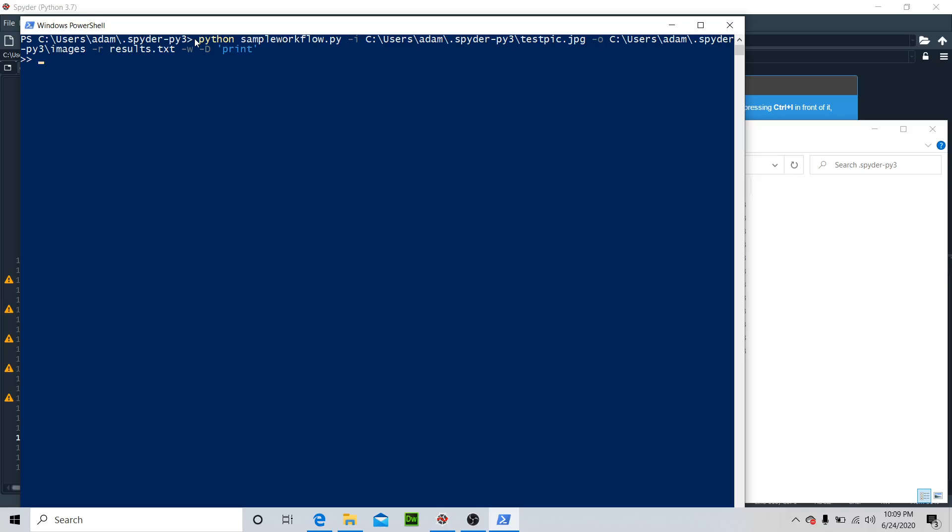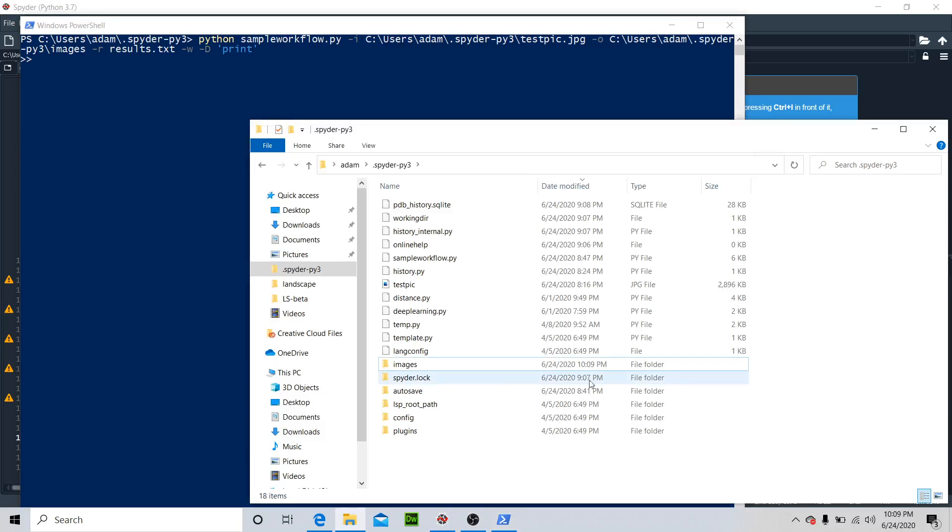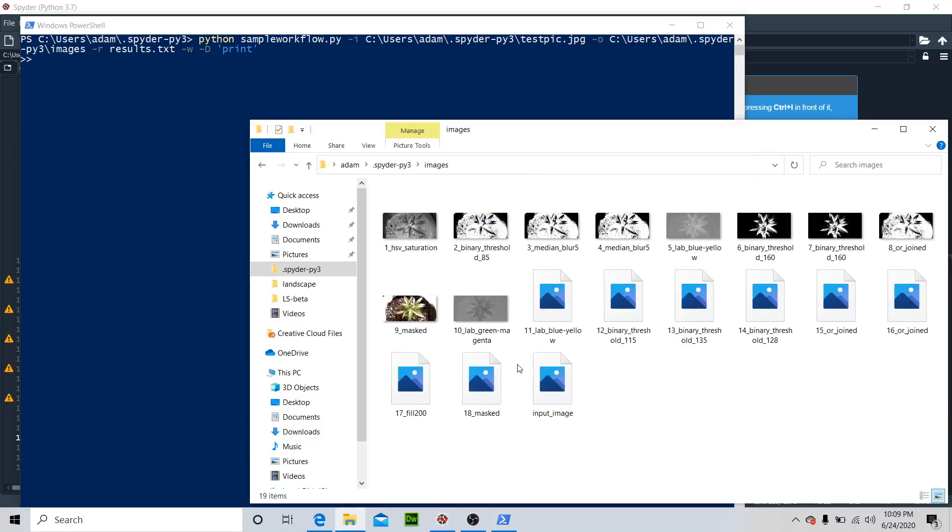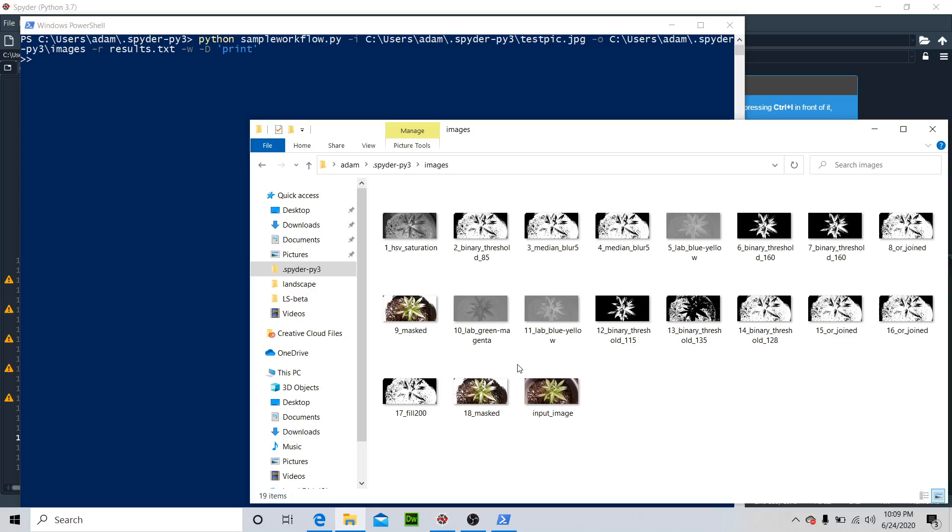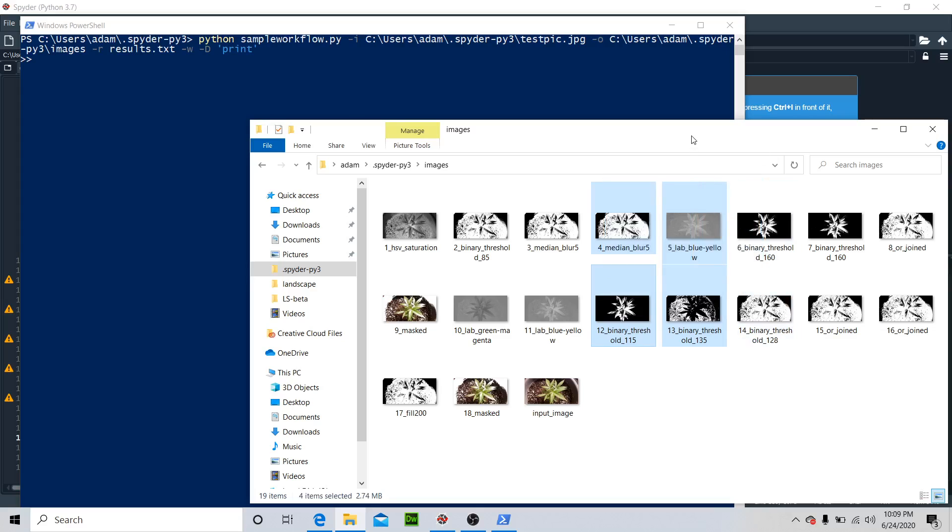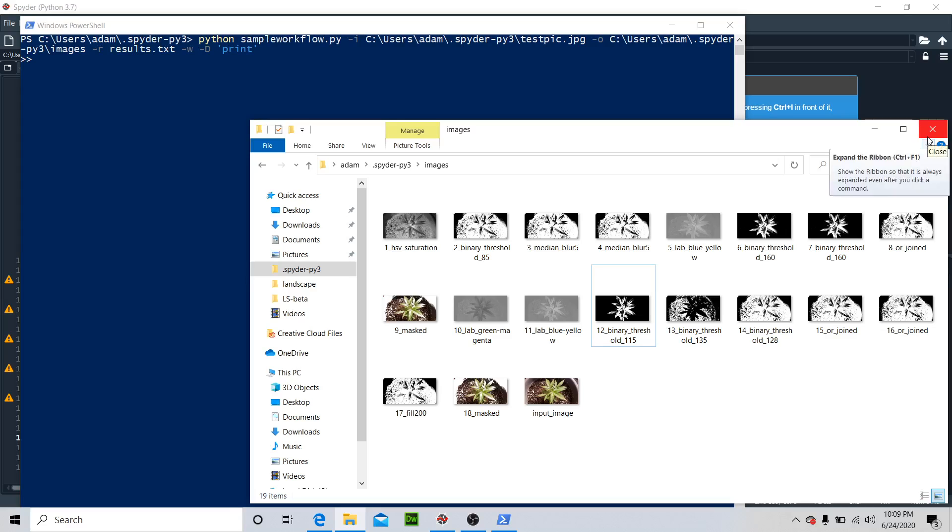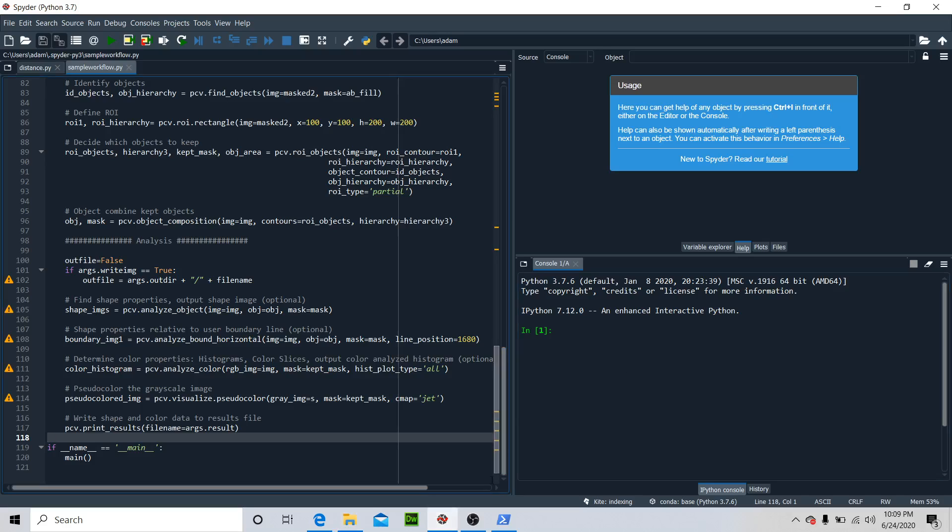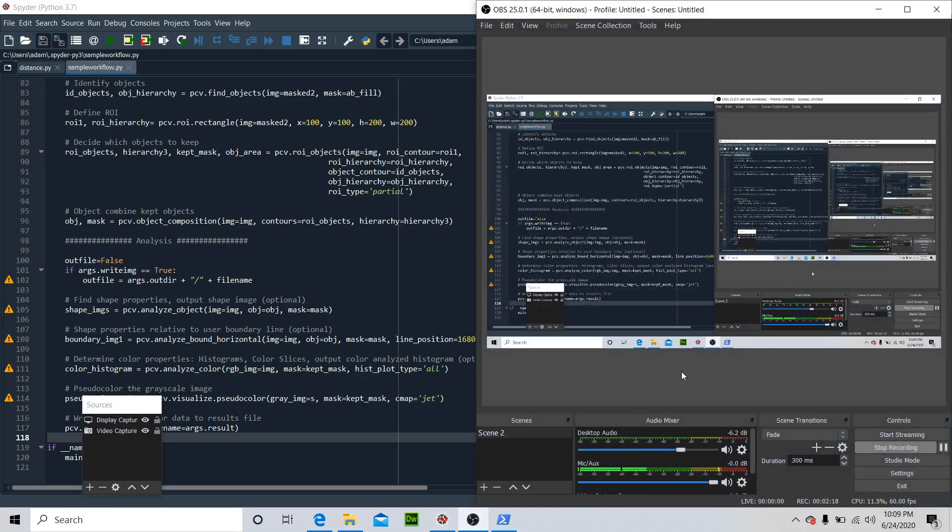The code is there so you can have something ready. Basically what happens when you run it is these images will populate here. If you're running on Linux or Mac, it should run automatically and print those out intermittently. All right, that's the end of this video. This one's even quicker than the last.